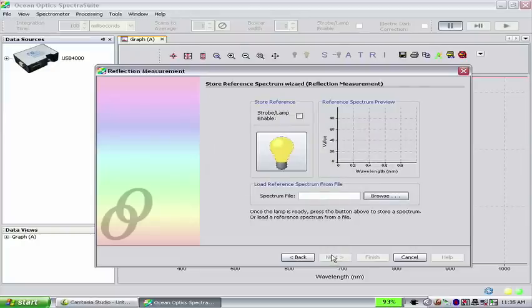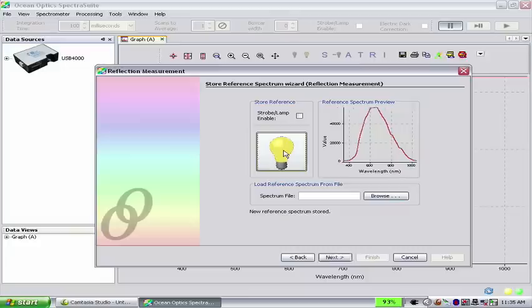Click on the yellow lightbulb button to store the reference. Once the reference is stored, a preview of the spectrum is shown in the Reference Spectrum Preview pane. Now click Next.